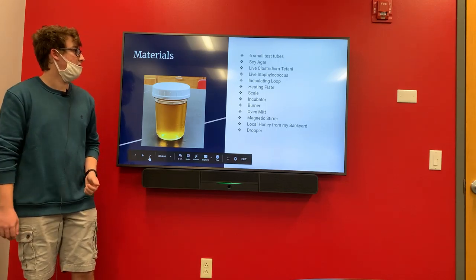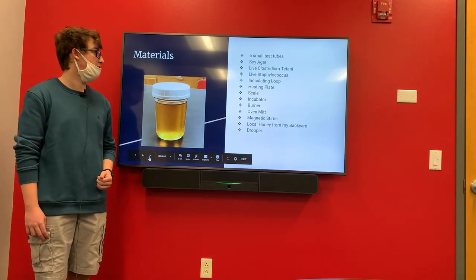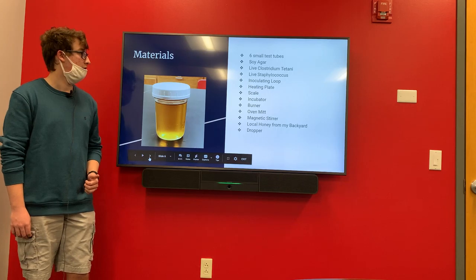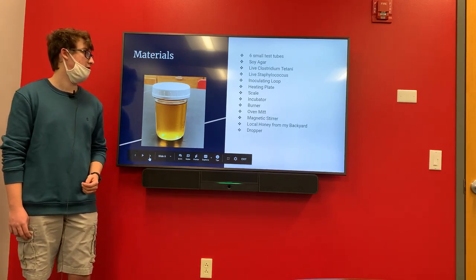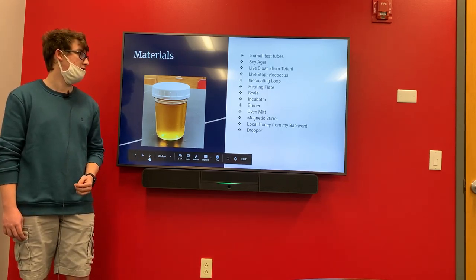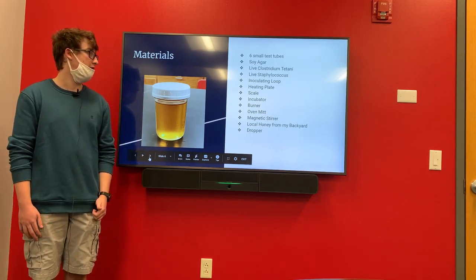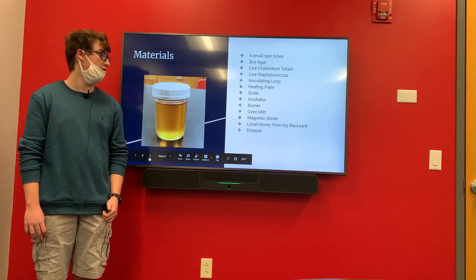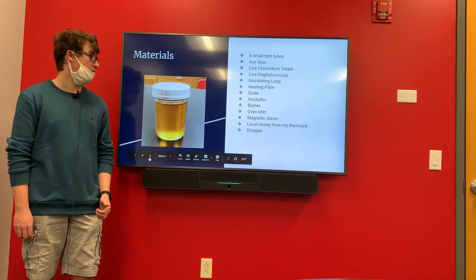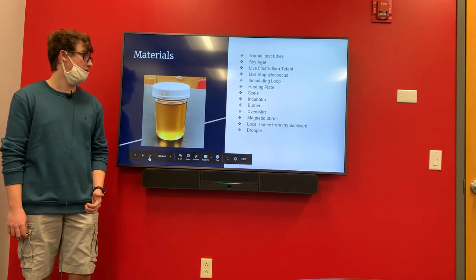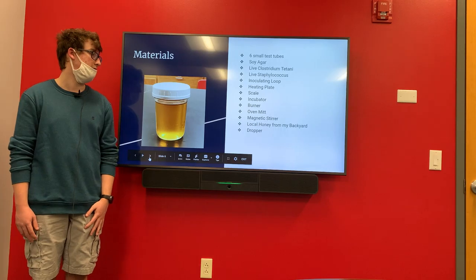The materials I used were six small glass test tubes, a soy agar broth, live Clostridium tetani, live Staphylococcus, an inoculating loop, a heating plate, a scale, an incubator, a burner to clean the inoculating loop, an oven mitt, a magnetic stirrer, local honey from my backyard, and a dropper.